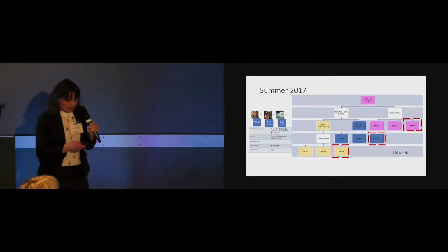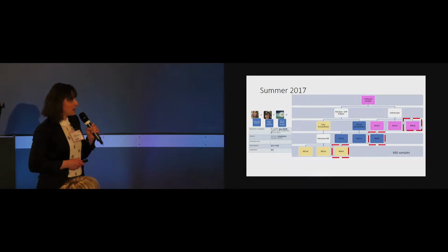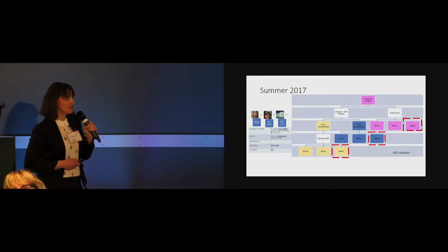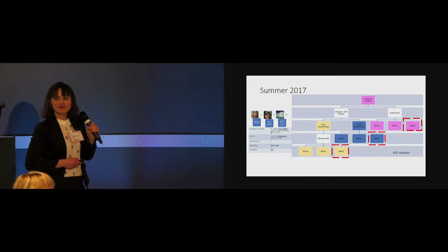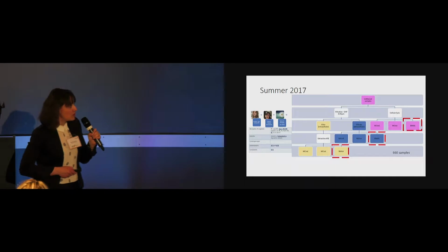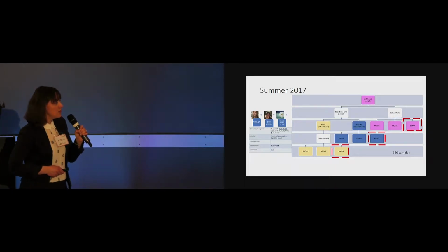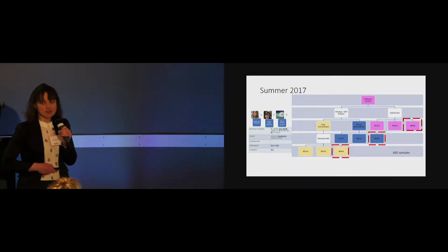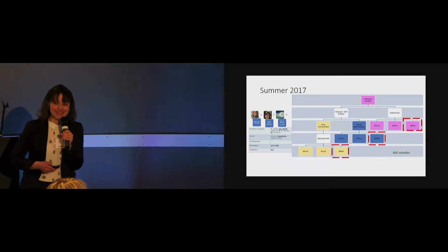Okay, so at the beginning, in summer 2017, we had a great team. We had Audrey, who worked, since the project started in October 2016, all the winter to introduce more microcystins into the method. She also added the homoanatoxin and anabaenopeptin analysis, and cyanopeptolin. And this is our schematic evolution, how this is happening in the lab. I know right now I'm doing what Audrey did last year, so I hope I do as well as you. I'm trying to present this to the people.